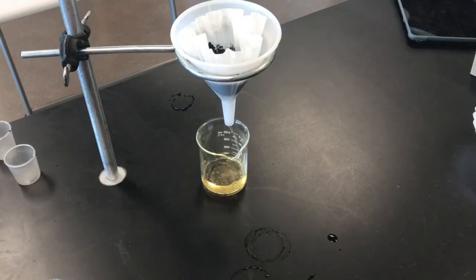So you're going to let it filter out for just a little bit, let this filter through the soil. You're going to run this 3 separate times for each procedure. So you're going to run it through, and in just a second, when most of the solution is filtered out, we're going to run another trial really quick here.